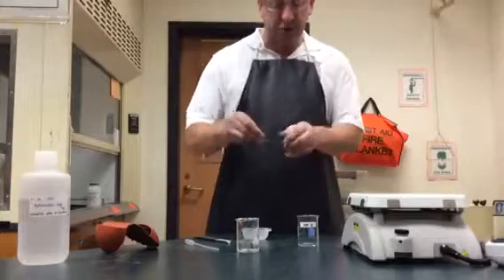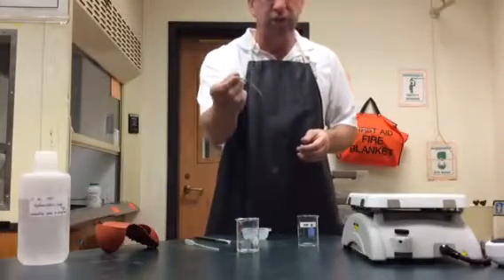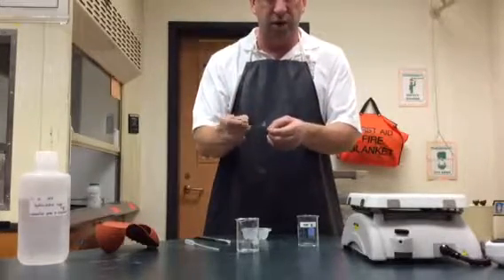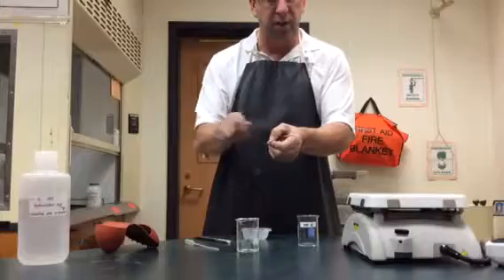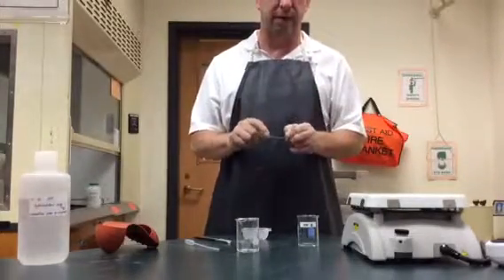The magnesium should be nice and shiny — most of the pieces we have are shiny. You shouldn't really need steel wool, but if you get magnesium that's really dull or looks corroded, you might need some steel wool to scrape it. Once you do scrape it, you'll have to go ahead and re-mass the magnesium.